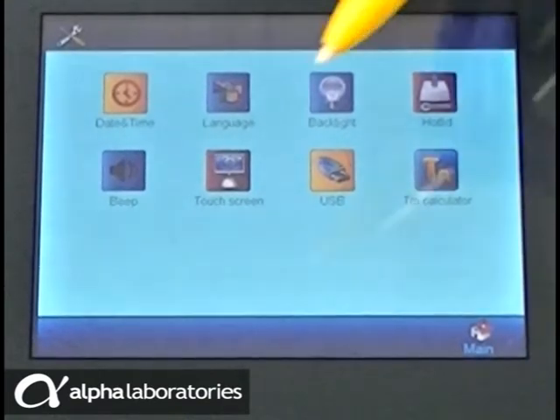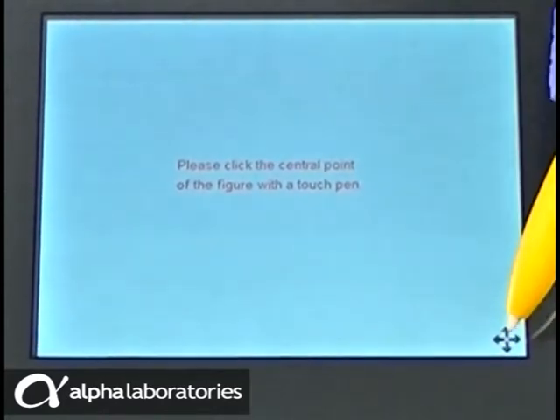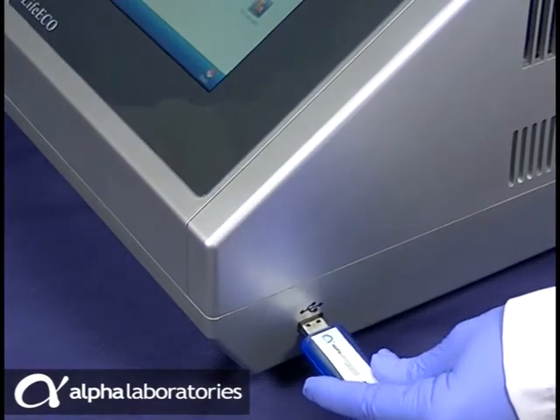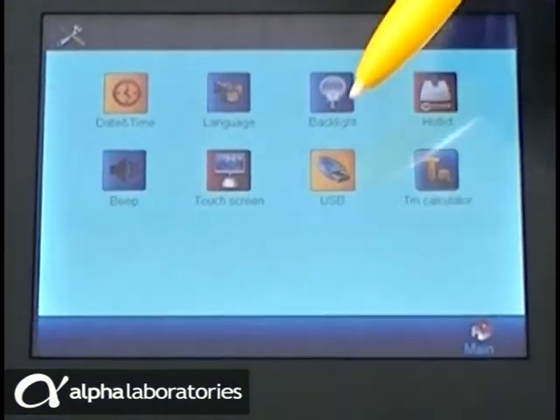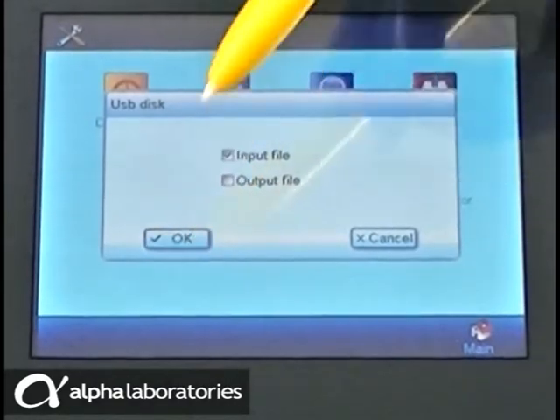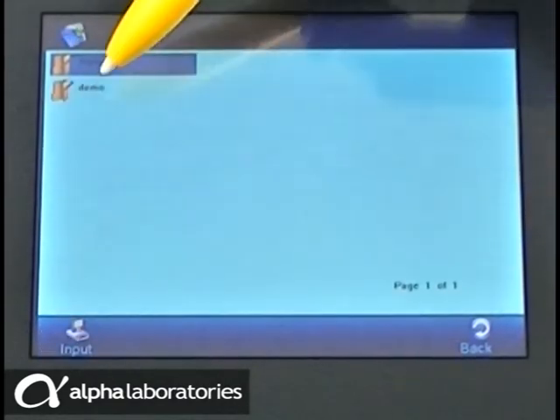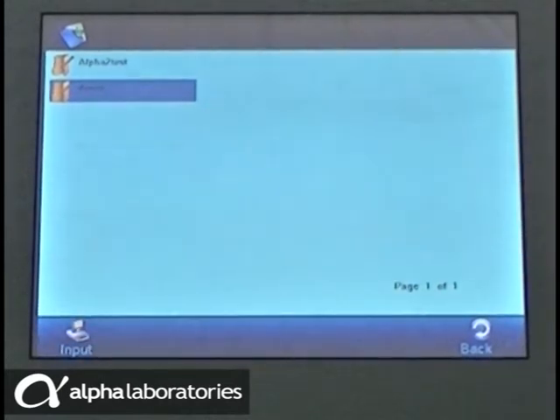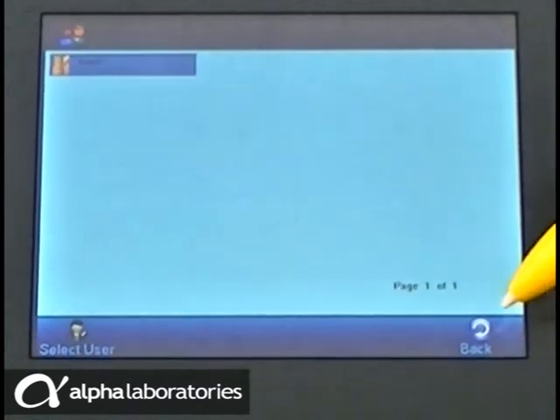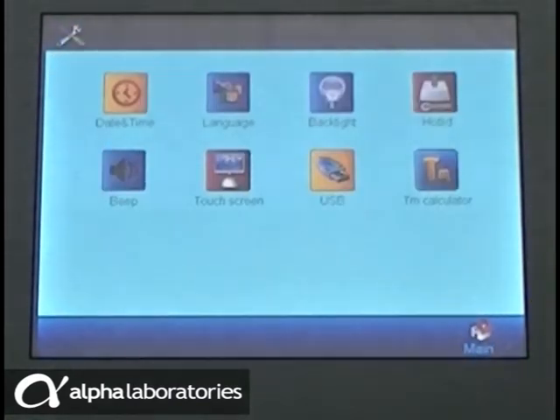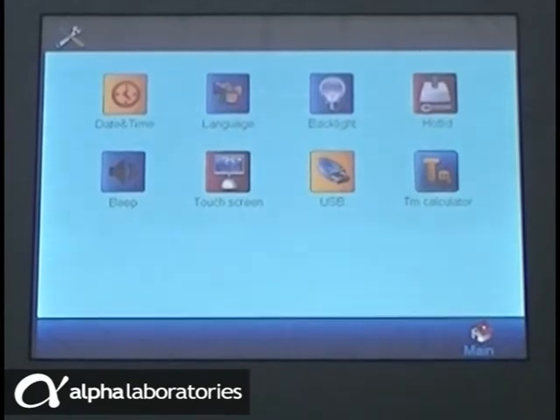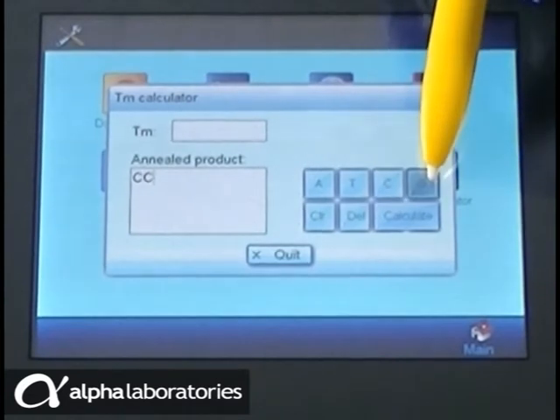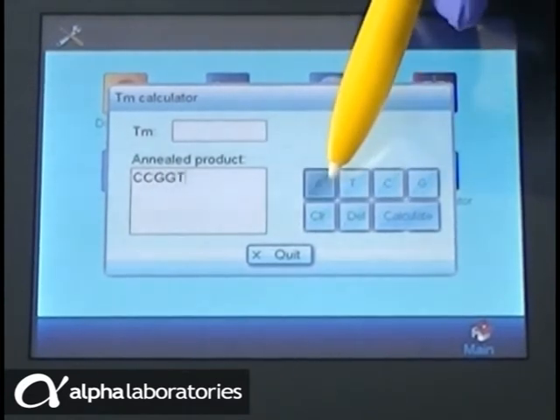This function tests touch screen responsiveness. The USB function enables pre-programmed protocols to be imported from a USB flash drive. Lastly, the melting temperature calculator helps you identify the best annealing temperature to target when optimizing for a new sequence. Just enter the code of your target DNA and touch Calculate.